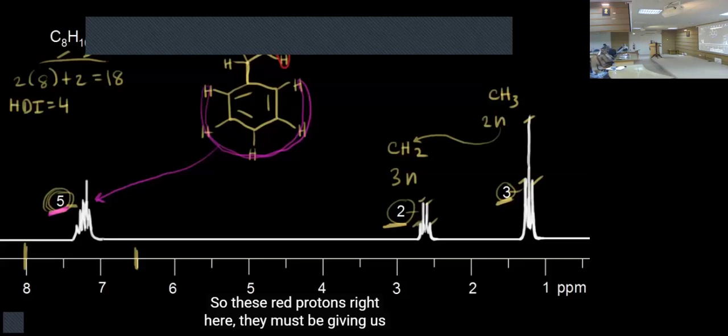Okay, so except Abdul Mateen, because he has done absolute. So all others are technicians. So they do things as per their experience. But you know your compound very well. You know from which plant, which species, which genus you are working and isolating these compounds. So you have some idea of the type of skeleton and the type of spectrum that you are expecting, right?